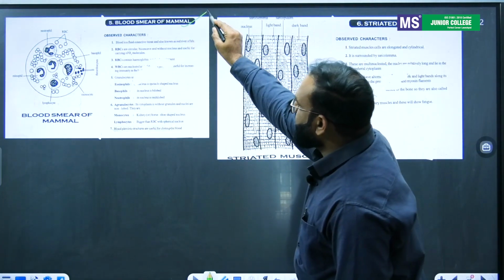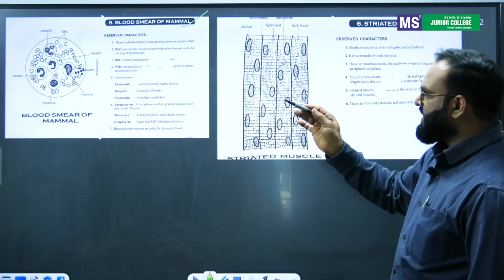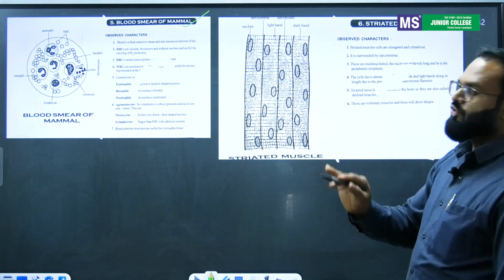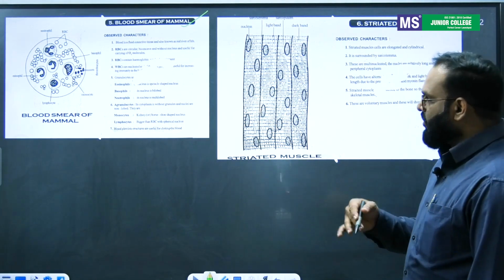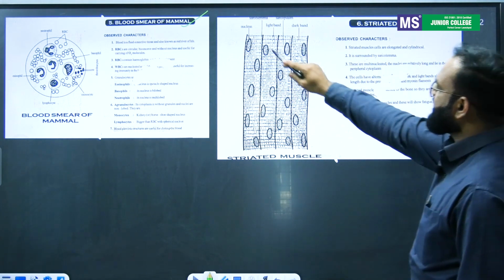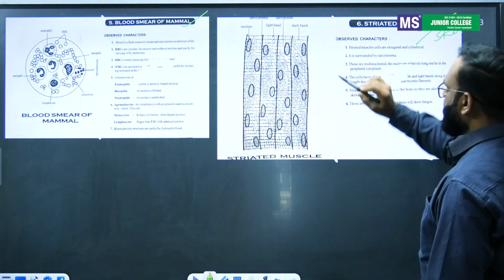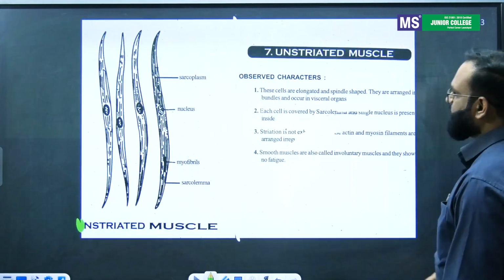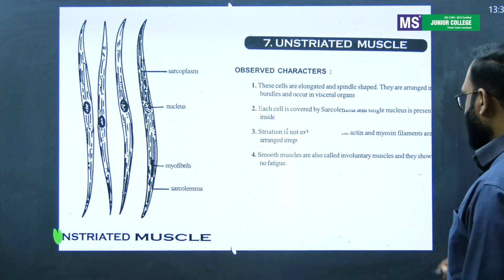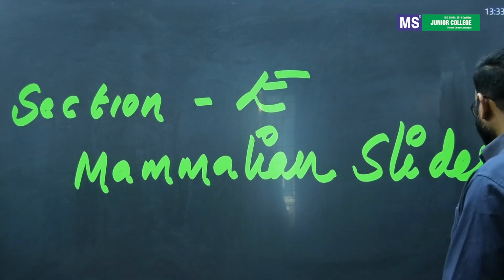A blood smear of mammal. And what are the cells present? You observed in the blood smear RBC, WBC; in WBC, granulocytes like eosinophils, basophils, neutrophils, and agranulocytes like monocytes, lymphocytes, everything. And striated muscle, multinucleated; smooth. This striated muscle or skeletal muscle, that point you have to write, students. Even smooth muscle, unstriated and uninucleated. These are involuntary muscles.